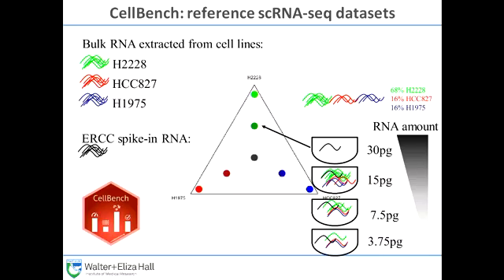And so Matt Ritchie's group at WEHI, Matt gave this week of lectures last year. He and his group and many colleagues produced this paper and R package and data set called CellBench, which provides several reference single-cell RNA-seq data sets that are carefully thought out so that we have some data sets where there is some known ground truth that we can use to evaluate different single-cell RNA-seq methods.